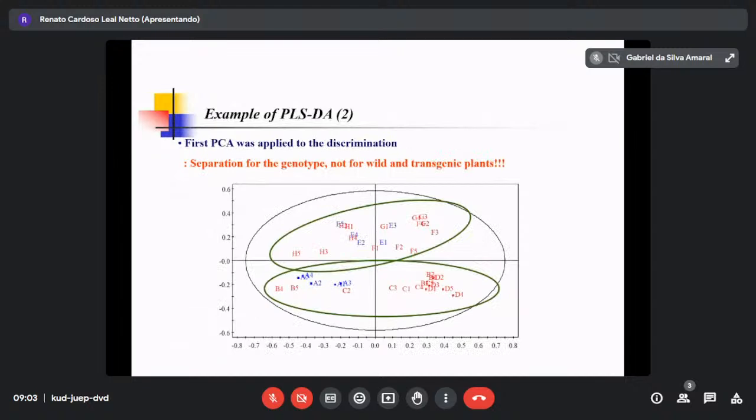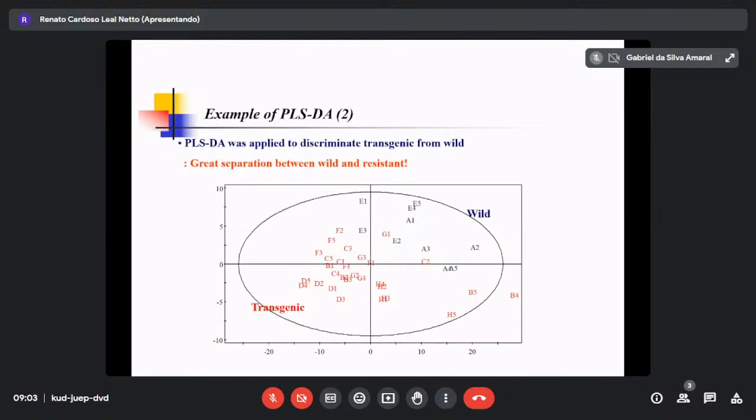In PCA, P4 is not included, but when you change to this one, here P4 is slightly included, and when you do OPLS-DA, it can be included. So deletion is really the last step.